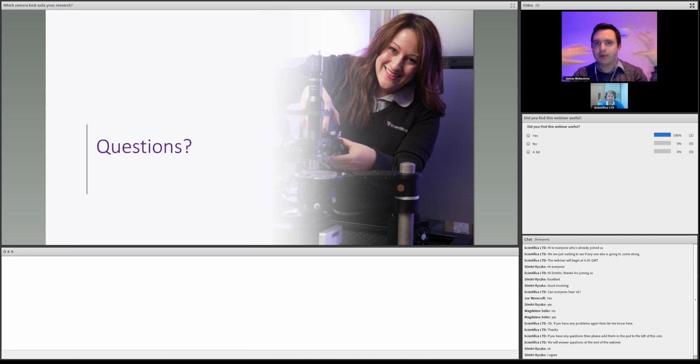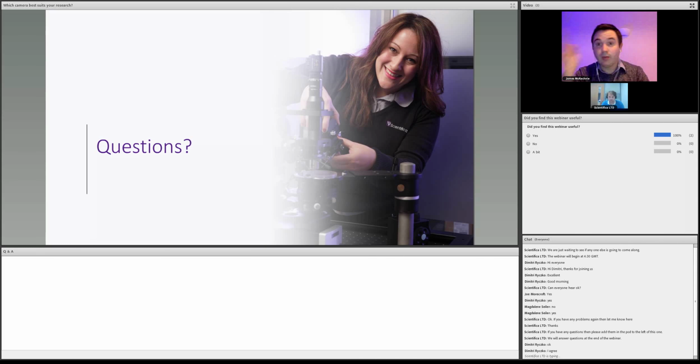Yes, you can correct in post. Let's put it this way, you can work out where it came from and do something about it. But let's use the example I spoke about earlier, where you want to do dual channel. The problem is that half your sensor will have exposed for some of one channel and half for some of the other channel, so it's not as simple as just reassigning.